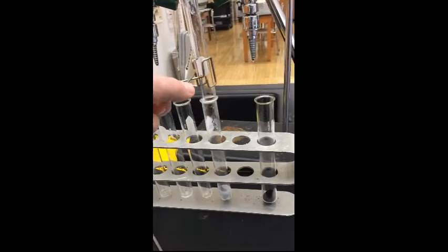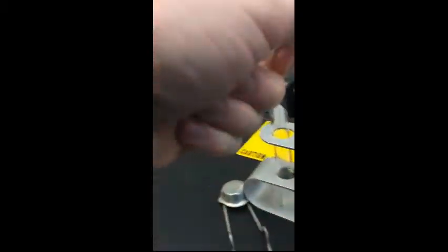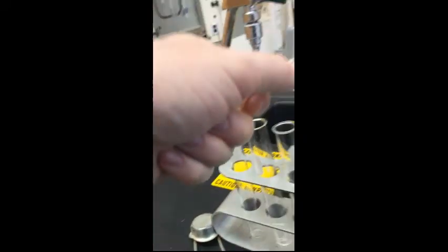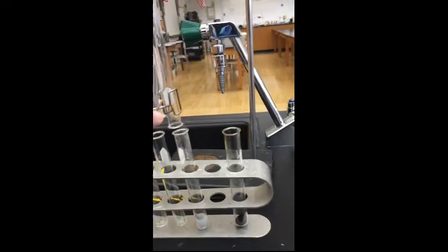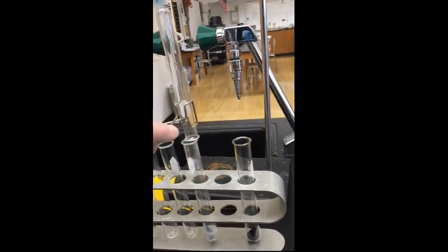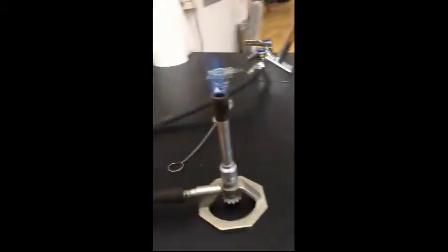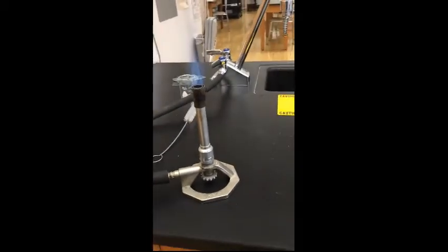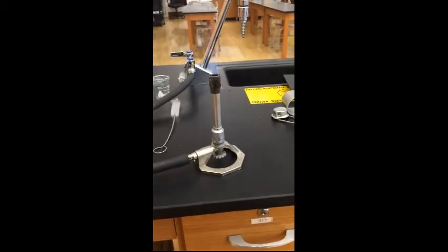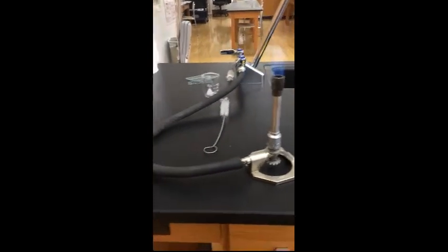Okay, that's all I'm going to get on this one. Okay, so basically it's making a noise. Usually it has a higher pitched sound, like a chirping noise. But that's all we got from that today.